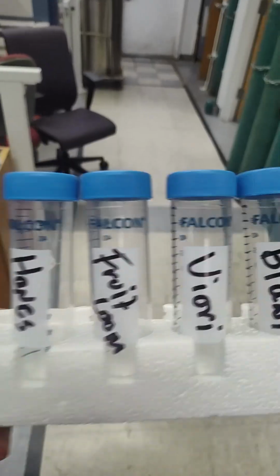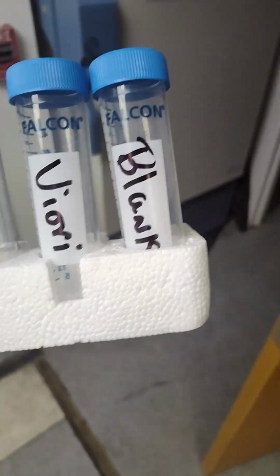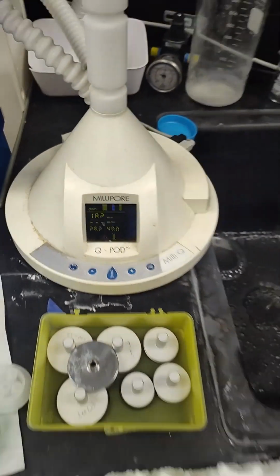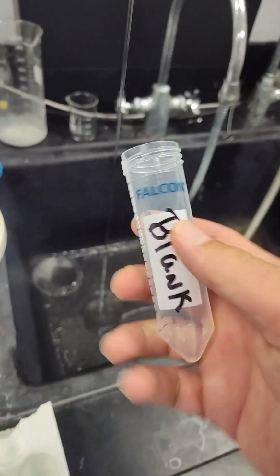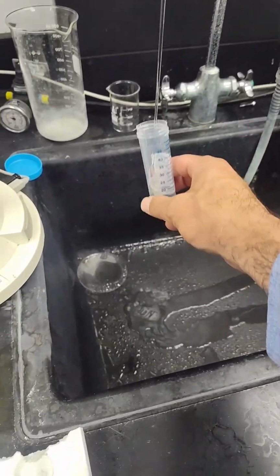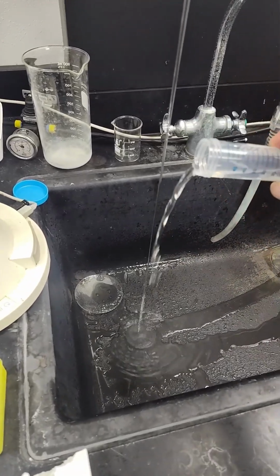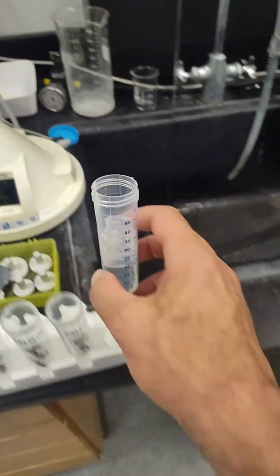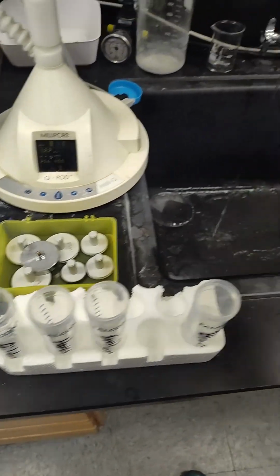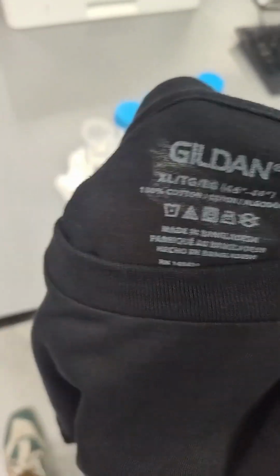Alright, we got the tubes and we're throwing in Vuori into the mix, the high end. And we got a blank, of course. Good scientists. We got the Milli-Q flowing, 18.2 megohm water. Anyone who's questioning if the water's clean, this is as clean as it gets. Let's do 30 mils per tube, and we're just going to fill up all the tubes with the same amount of Milli-Q water.